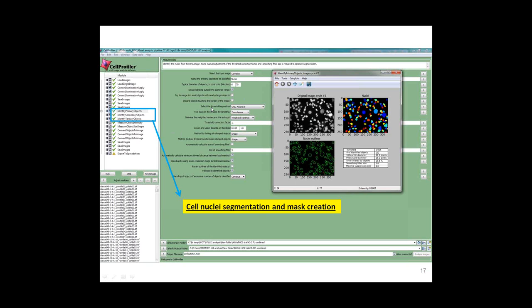There are a bunch of thresholding methodologies available in CellProfiler, and here I'm using Otsu adaptive, and you can choose other methods depending on your application. I fine-tuned the parameters a little bit. Here you will see a panel of the original image, the identified nuclei, and the outlines. There are a few statistics here that you can visualize during this pipeline cycle.